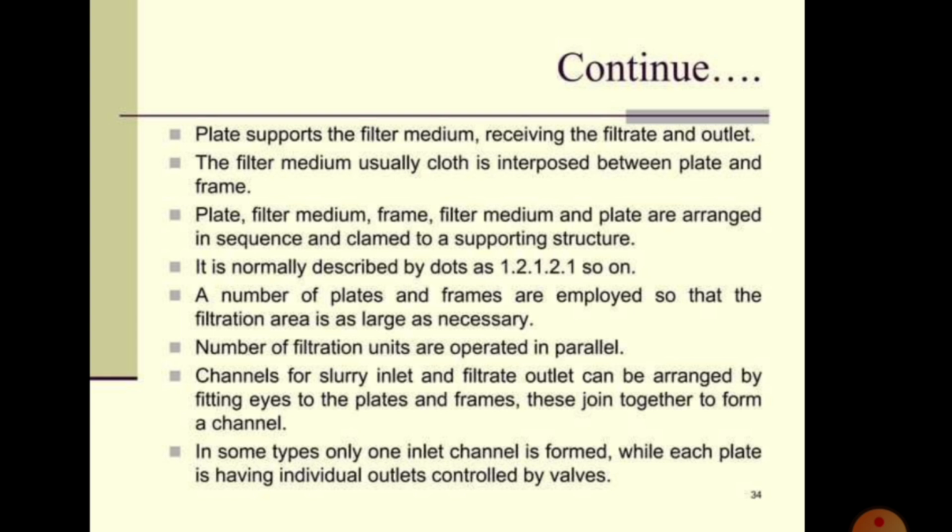Channels for slurry inlet and filtrate outlet can be arranged by fitting eyes to the plate and frame. These join together to form a channel. In some types, only one inlet channel is formed, while each plate has an individual outlet controlled by a valve.